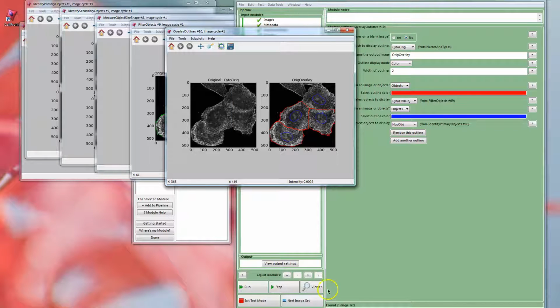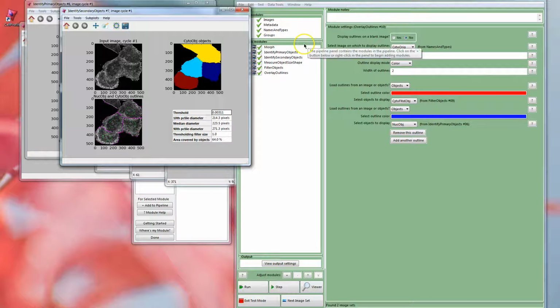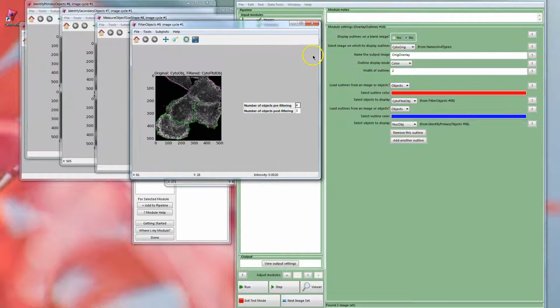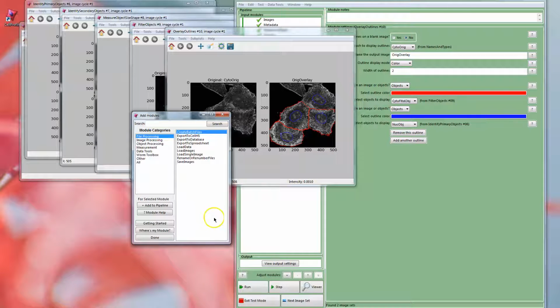And so you can look through these different windows and see it identifies nuclei, identifies some of the cell boundaries, and does a really good job of segmentation in between them. And you can get some measurements on these objects and filter them and decide you don't want certain objects, and create overlays, which I like for output, so you can have a folder of output images just to see how it's done and how well it performed.